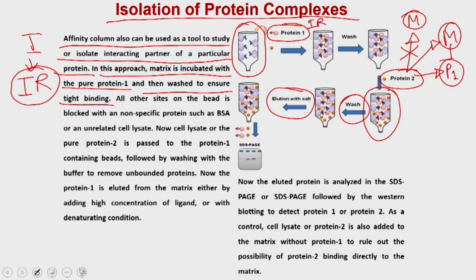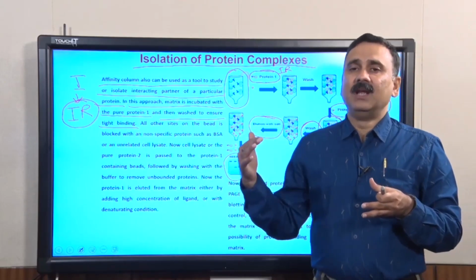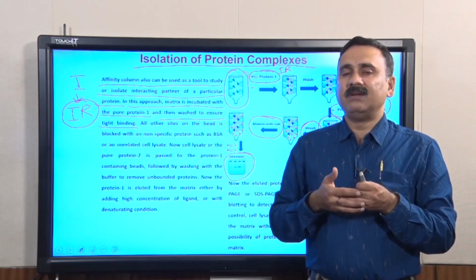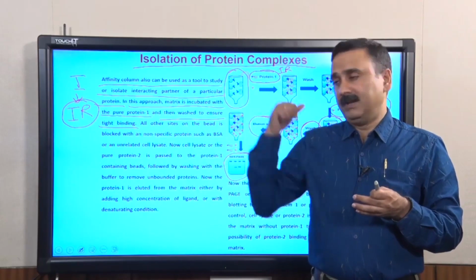So, both protein 1 and protein 2 are going to be eluted, and then you test these on SDS-PAGE, and the pattern of elution is going to tell you whether both proteins are interacting or not. If you are using the cell lysate, then multiple proteins are going to come out. In that case, you have to do control experiments where you incubate the lysate with the beads without protein 1, and that works as a negative control, so that you will know that these are the factors which are binding to the matrix directly.